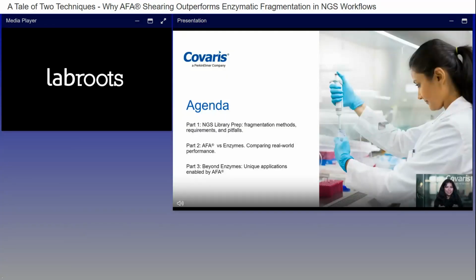So we're going to be bringing you this story in 3 parts today. Part 1 is going to be an overview of next-generation sequencing, NGS library prep, fragmentation methods, requirements, and pitfalls. Part 2 is going to be a direct comparison of adaptive focused acoustics, AFA, versus enzymatic processing in NGS workflows, really comparing some real-world performance of the two methods. And then finally, for part 3, I want to take you beyond enzymes and highlight some unique applications where AFA is really uniquely poised to enable workflows.